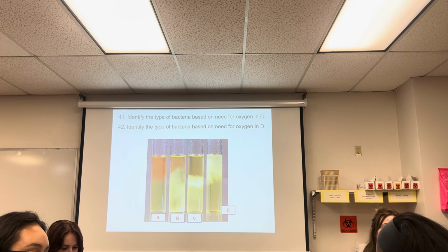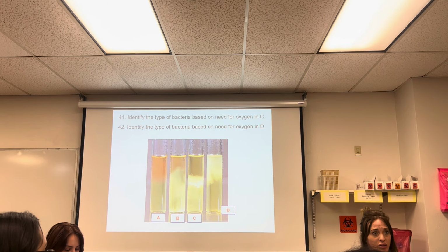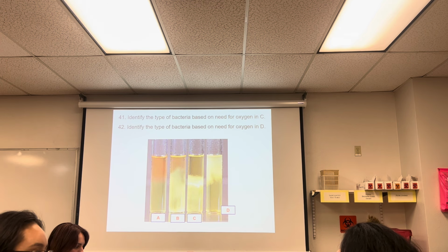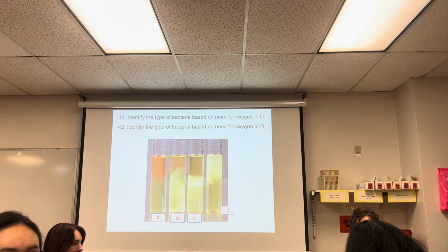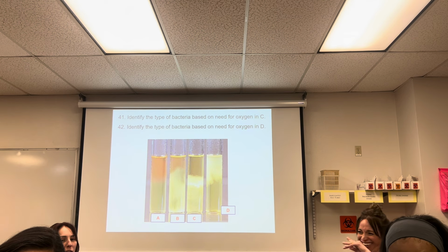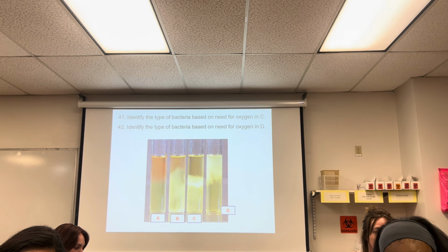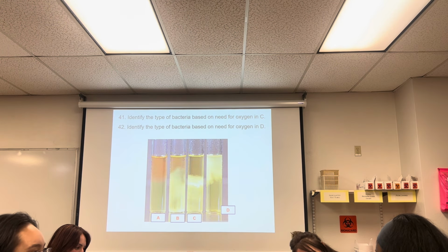Oh, you can't open it up and look at it. The Bunsen burner, the little... this thingy. A rack, and then lens paper. And then this thing, the fire starter. It's not a fire starter. What is it called? Lighter. Striker. It's the striker. We're gonna call it by what it is.